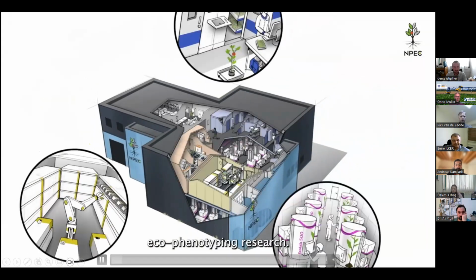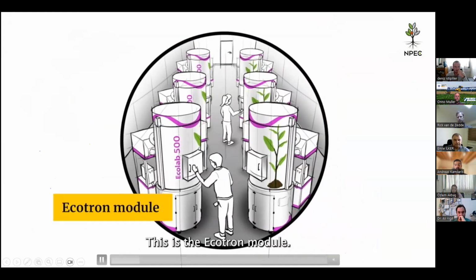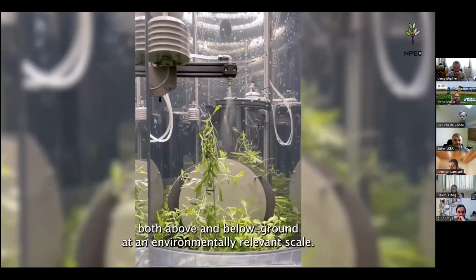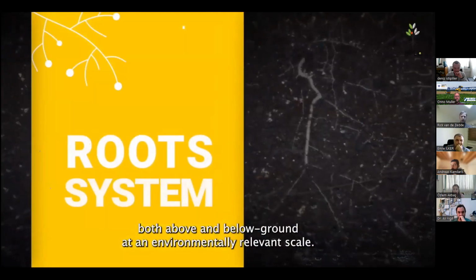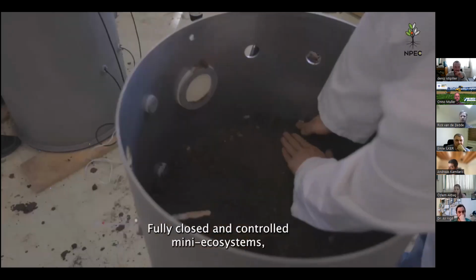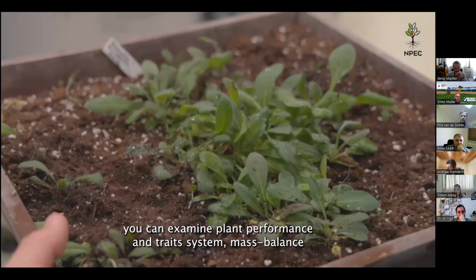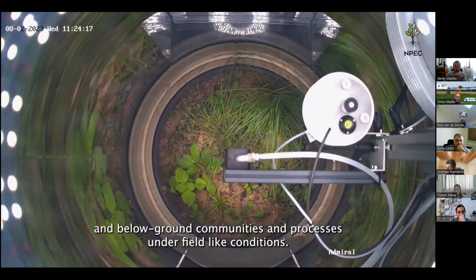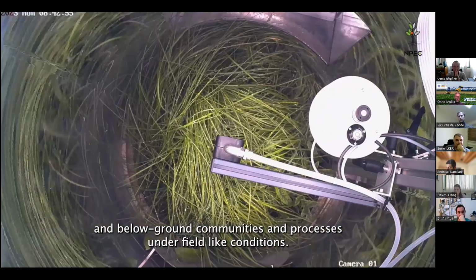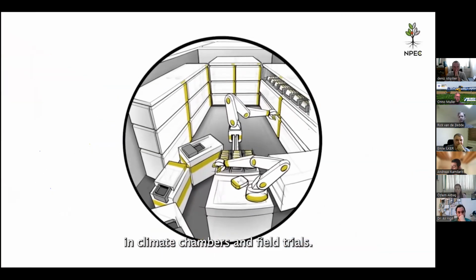Okay. So I'll just show you a short video of the 3 modules in Utrecht. So these are the ecotrons. Hopefully the bandwidth is good enough to at least show you a few images. So these are big cylinders where the roots are growing in interaction with other plant species. There are a few cameras, but mainly sensors in there to monitor the fluids inside the soil, which are then sequenced to figure out which bacteria are active around the root systems. So it's like a tiny field, you could say.